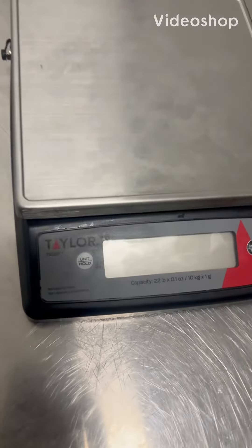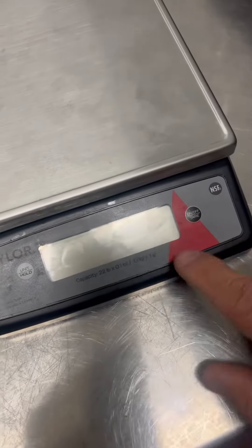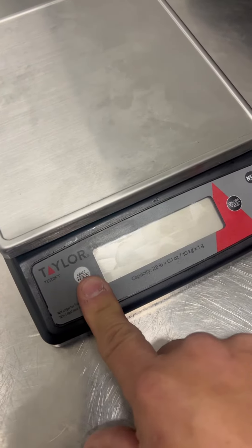This is a calibration adjustment of a Taylor TE22FT. Make sure your balance is off. You're going to turn it on, and then you're going to hit this key four times quickly and hold it down.